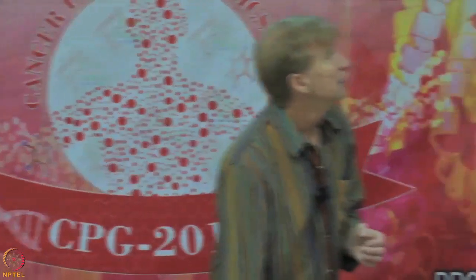Another thing that you want to do is enrichment. If you're after phosphopeptides, you don't have to sequence everything else to get to your phosphopeptides, so you use something to pull them out. We use immobilized metal affinity chromatography. If you're interested in lysine acetylated peptides, you can isolate them with an anti-acetyllysine antibody. So in choosing what you want to do, you're looking to make a trade-off among these criteria.